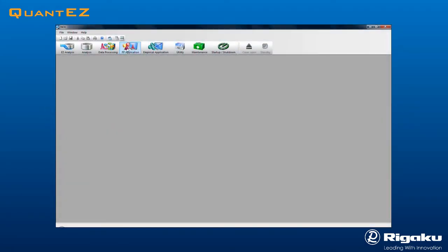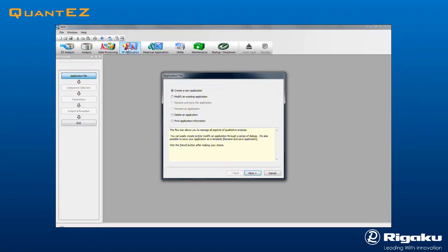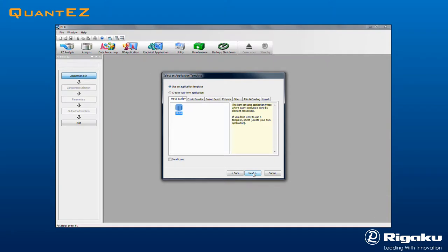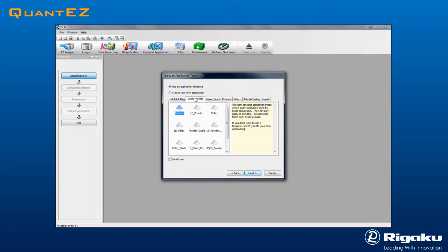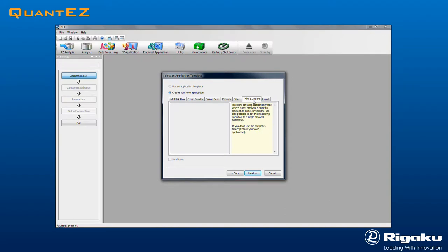Click the FP Application icon. Select Create New Application in the dialog box and click Next. The instrument is equipped with a selection of standard templates, including metals and alloys, oxide powders, fusion beads, polymers, multilayer films, and liquids. In this example, Oil is selected, followed by the Next button.